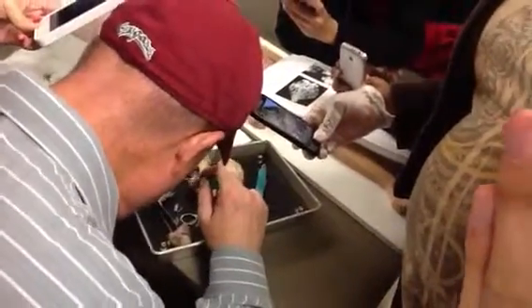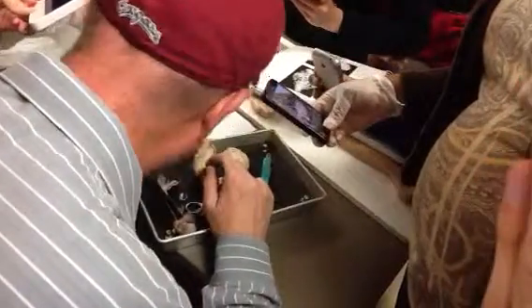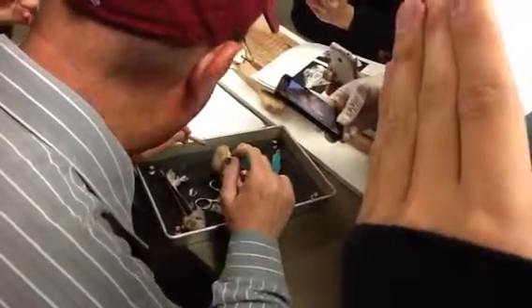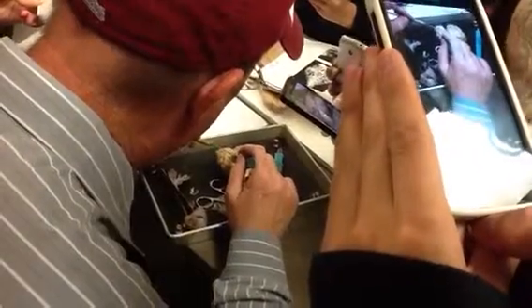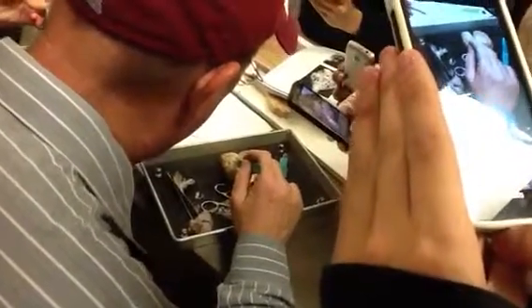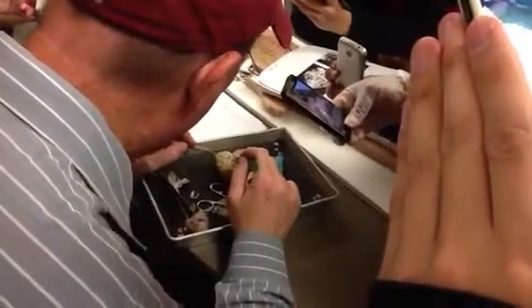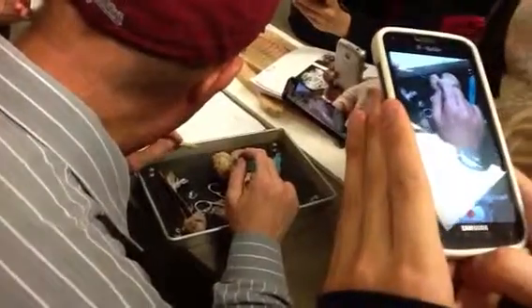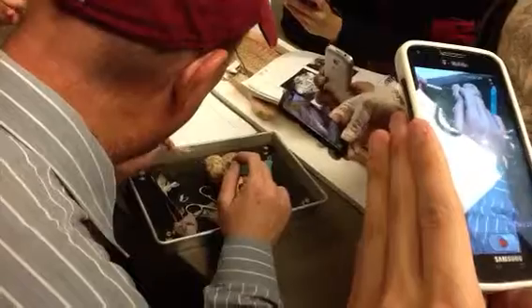Okay. It's not real. I mean, you could get in there and see it. Okay, now the convolutions are the folds, so they're a combination of the sulci and the gyri. It's all together. That's a convolution, and the sulcus is the depression. And the gyrus is the ridge.